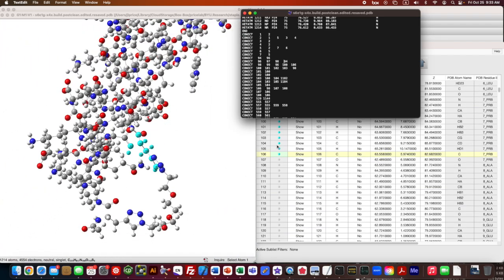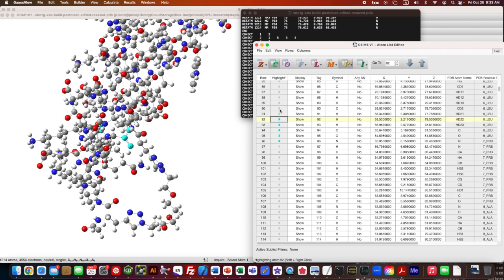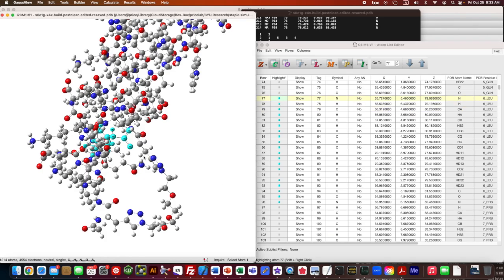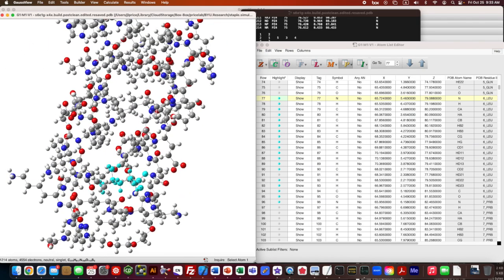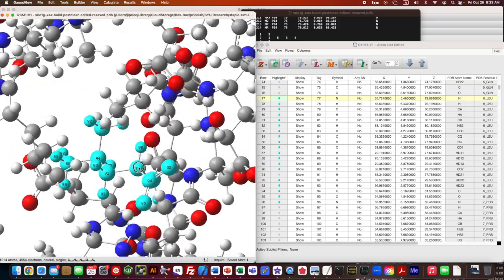Then I'm going to look. The places it usually gets wrong are places with unnatural residues. I previously noticed earlier that the leucine seemed to be messed up. I don't think it is now, but I'm just going to highlight the leucine to confirm that it's all fine. Shoot, there are a ton of atoms in leucine. And that looks mostly fine.